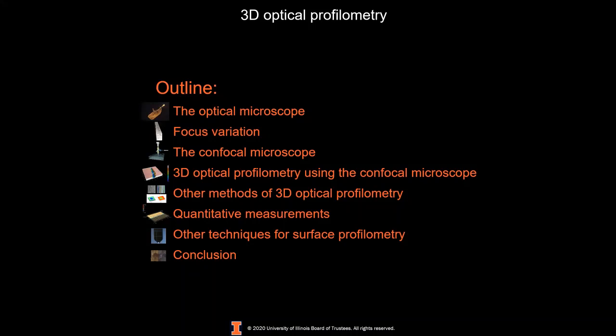Then after that, I'll introduce the confocal microscope and how it's used in topography measurements, comparing it with the focus variation method. I'll also mention a couple of other optical methods used for profilometry, though we won't spend too much time discussing them. Kathy will then talk about the data analysis and how to extract numbers from the optical profilometry measurements.